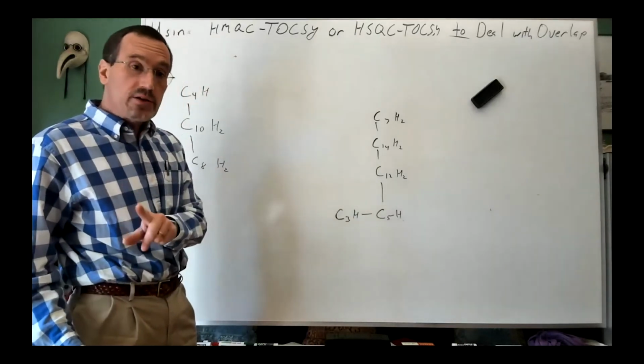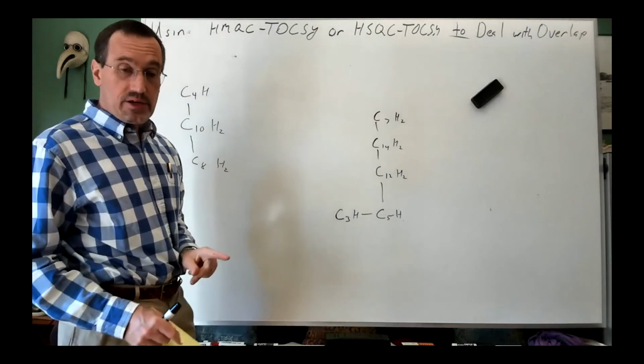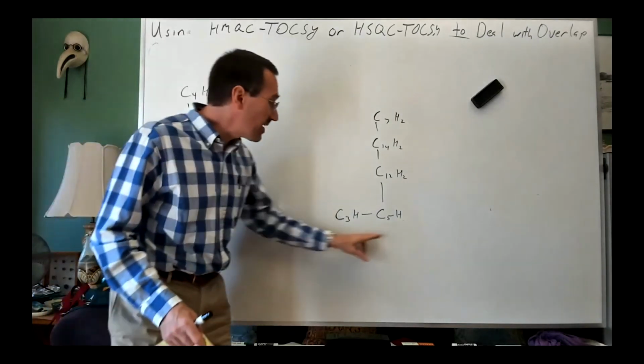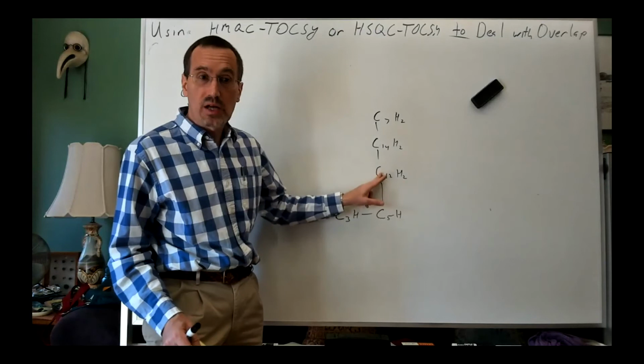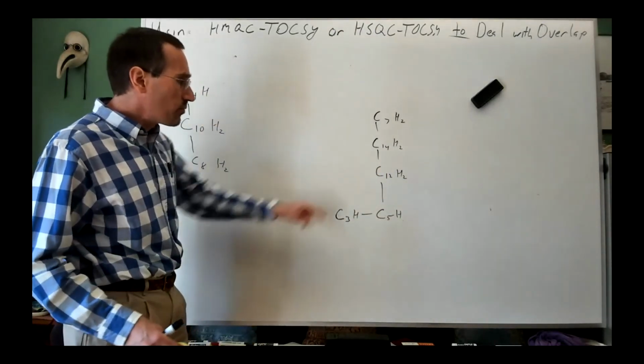No, it's a very good question. There was indeed a little bit of ambiguity there because even at 6 milliseconds, we saw 12 starting to come up. So you're absolutely right.